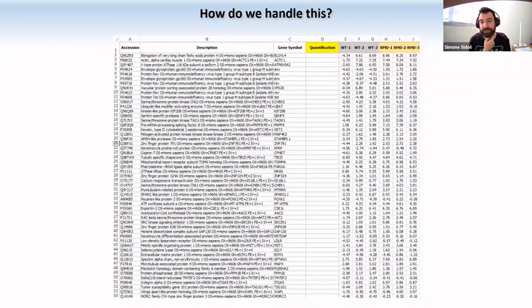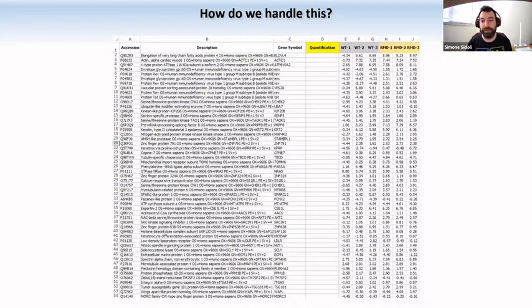We start from here, and this is what we're going to play with today. We're going to focus on just a comparison between two samples. I know many of you might have multiple conditions, but in 30 minutes we'll focus on how you compare two sets of samples.